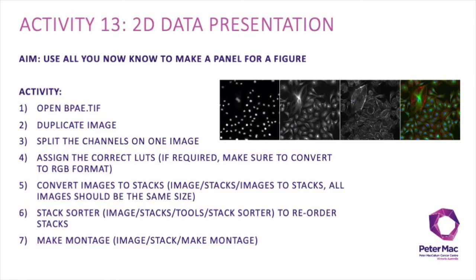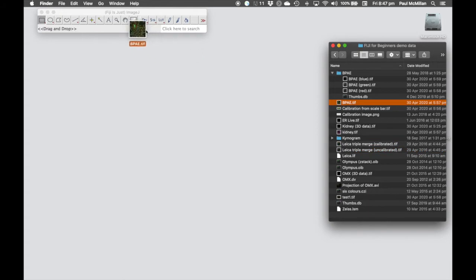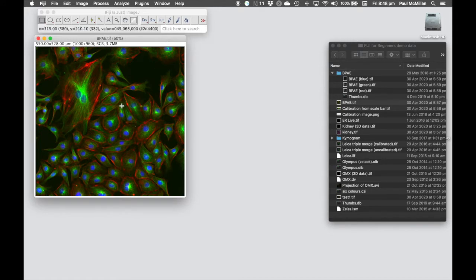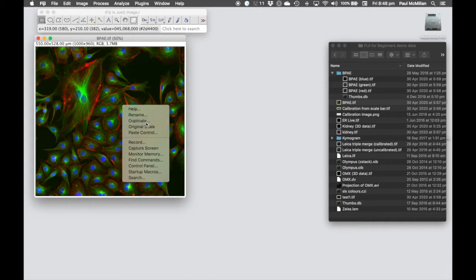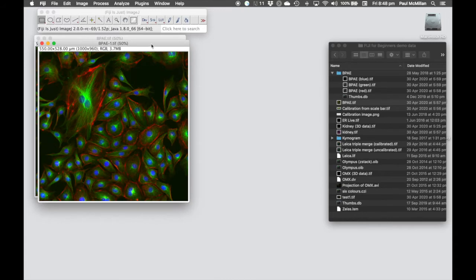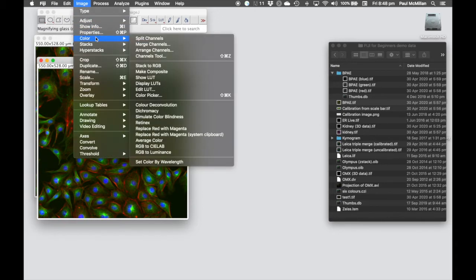In Activity 13, we're going to build a 2D data panel — three individual channels and then a merge at the end — using functions we've learned so far. We open the bpae.tif image. This is the merge we'll use. I'll duplicate it by right-clicking and hitting Duplicate.